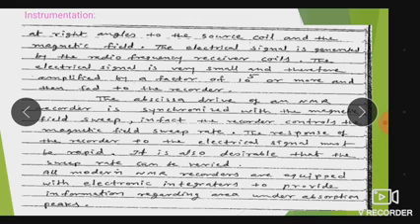The response of the recorder to the electrical signals must be rapid, and it is also desirable that the sweep rate can be varied. So all modern NMR recorders are equipped with electronic integrators to provide information regarding the area under the absorption peak.